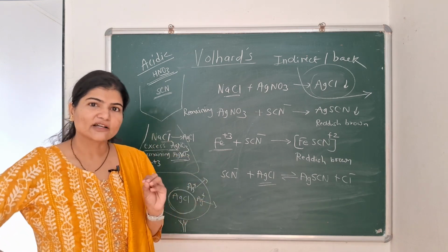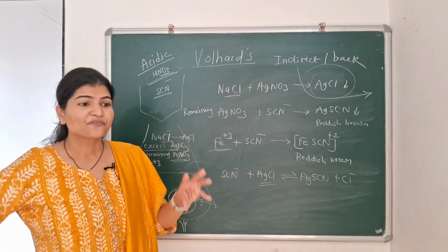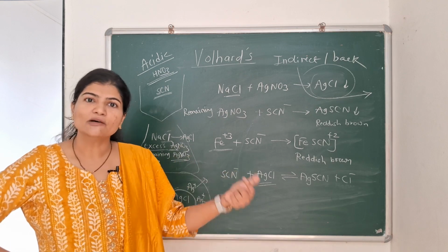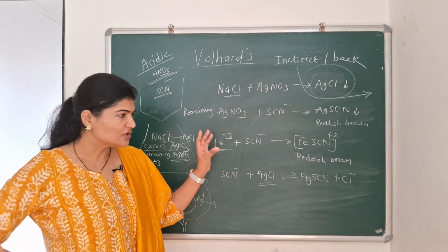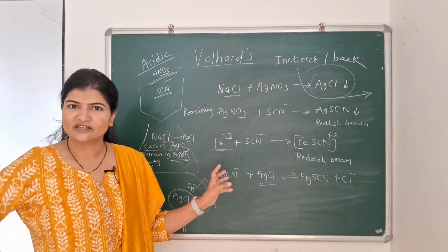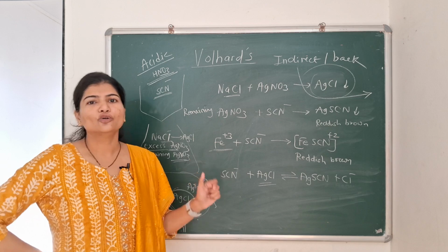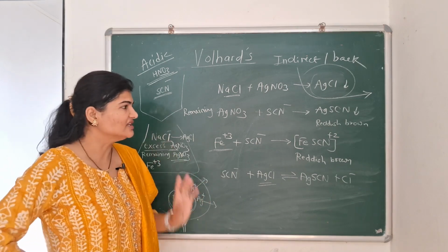This method is actually very effective for titrating all kinds of halide ions. The problem with iodides in Mohr's method is also overcome, and with slight modifications we can overcome the inherent problems in Volhard's method itself. So it is a good method to consider for detection of the endpoint in precipitation titration.